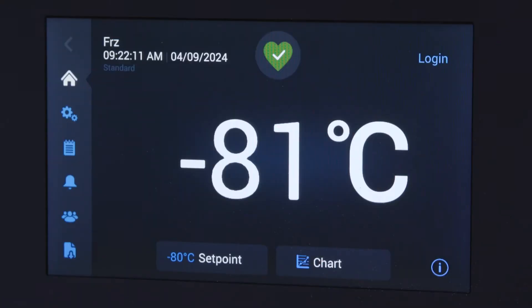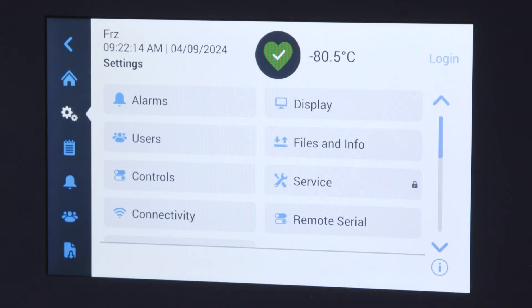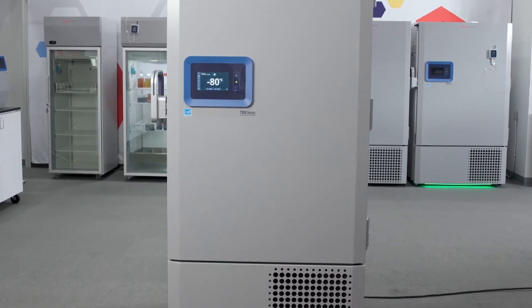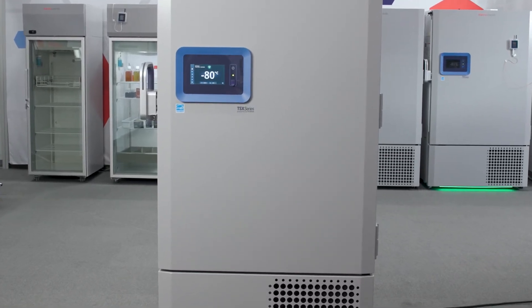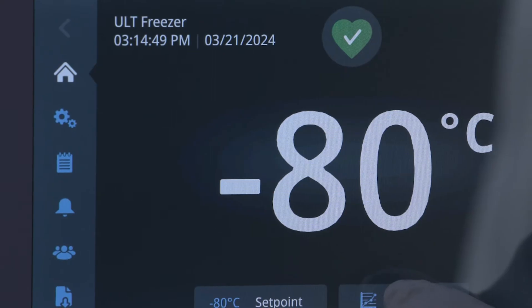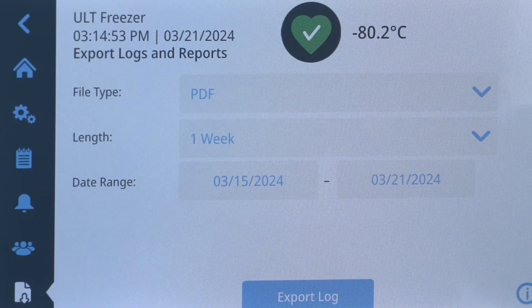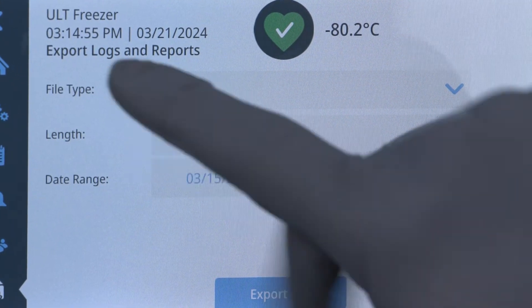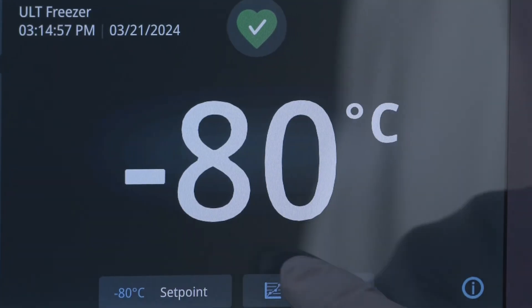Hello and welcome to this video about navigating the user interface of the Thermo Scientific TSX Universal Series ULT Freezer. The TSX Universal ULT Freezer user interface is a 7-inch capacitive touchscreen similar to your smartphone. Let's see what we can do with the interface.